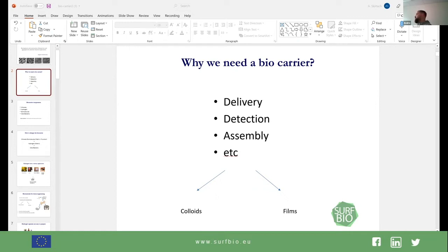This idea works not only in molecular kitchen, not just for such capsules and gel preparation, but also in bioprinting. Bioprinting is a simple and more well-known biocarrier, which carries our cells inside the gels, and we can position the tip in the printing and create different structures. After this, the cells proliferate and grow inside the gel matrix, fuse with each other and form the tissue. Such a simple effect of a biocarrier already exists, it's already applied a lot, and anyone can buy a bioprinter.